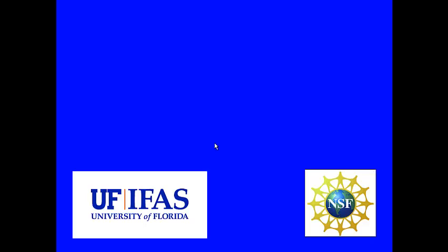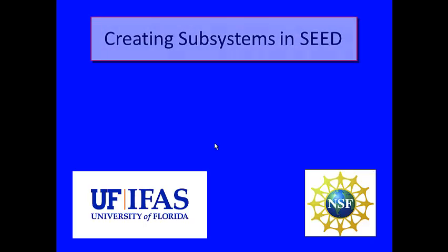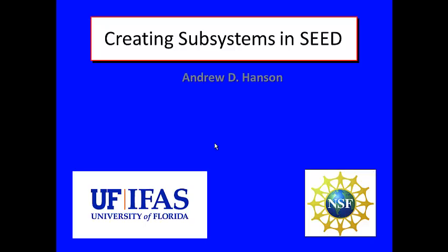This is the 6th in our series of videos, and it is entitled Creating Subsystems in SEED. The material covered in this lecture was prepared by Drs. Andrew Hanson, Valerie de Crécy-Lagarde, and Svetlana Gerdes.